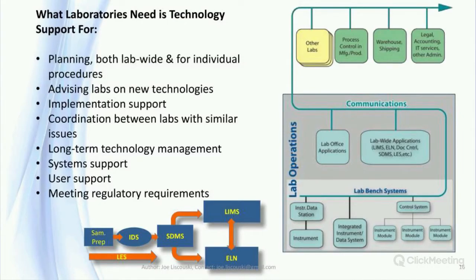Laboratory and senior management need to come to grips with the idea that laboratory systems are not just a collection of isolated, independent components. To be done well, they need as much planning and support as any manufacturing production line. Would your company allow production to be implemented as a series of independent steps, or would they rather have a smoothly functioning, integrated operation? To do that, we need people that can carry out the items noted on the screen.